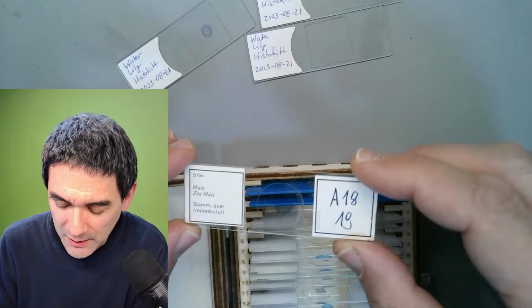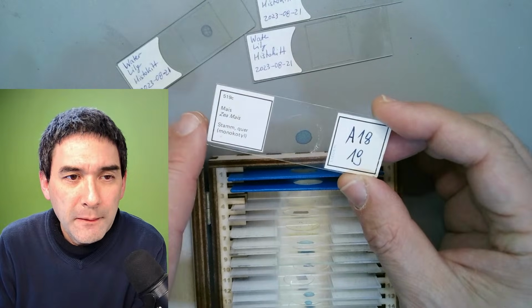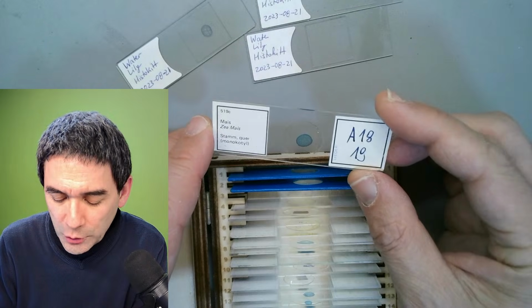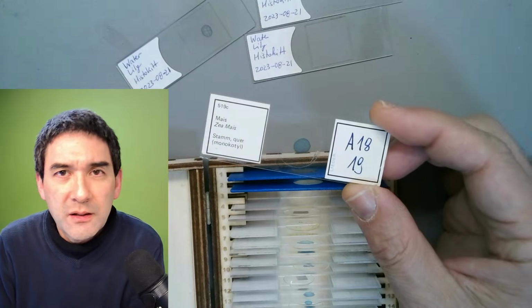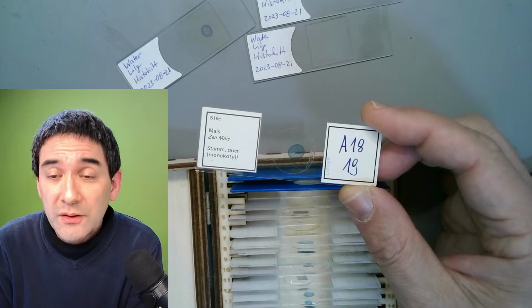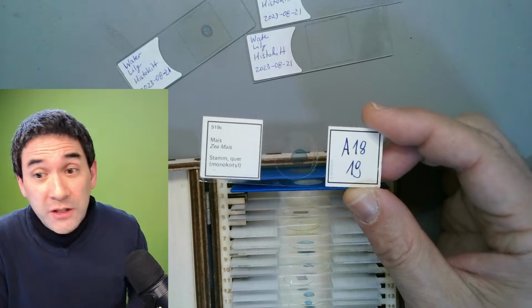Some of them are fairly old, from the 1980s. They're made by a German company that made them for educational purposes, and the company also produces slides for medical training. Yeah, histology slides from human tissue.